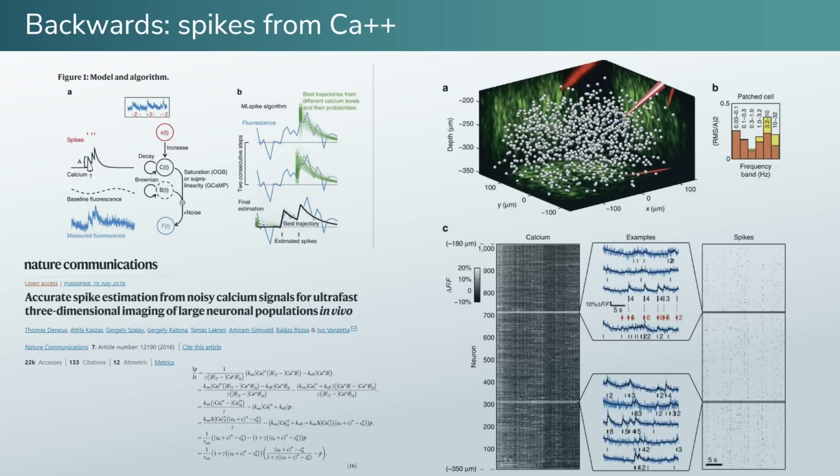They came up with solutions like that on the lower right panel, where the spike trains of hundreds of imaged cells are reconstructed from the recorded calcium signal. This looks great and pretty, but it is still possible that the two kinds of signal may bear somewhat different information too, which, in that case, may be lost in translation.